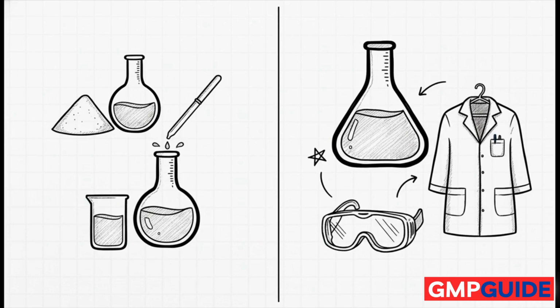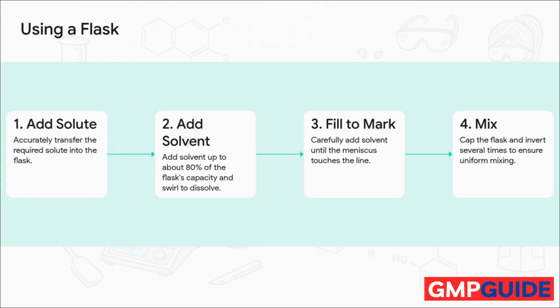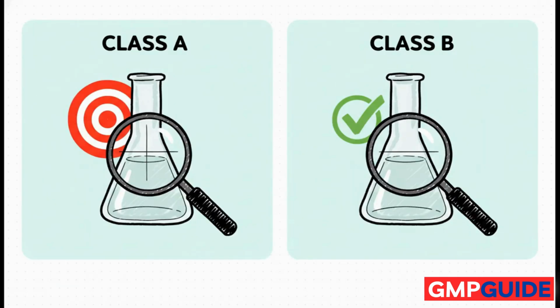You also need the right tools and, of course, to be safe. The most important tool here is the volumetric flask. It's designed for one purpose: incredible accuracy. To use it right, add your stuff, fill it about 80% of the way, mix, then carefully top it off. And for serious precision work, you have to use a Class A flask. It's just way more accurate.